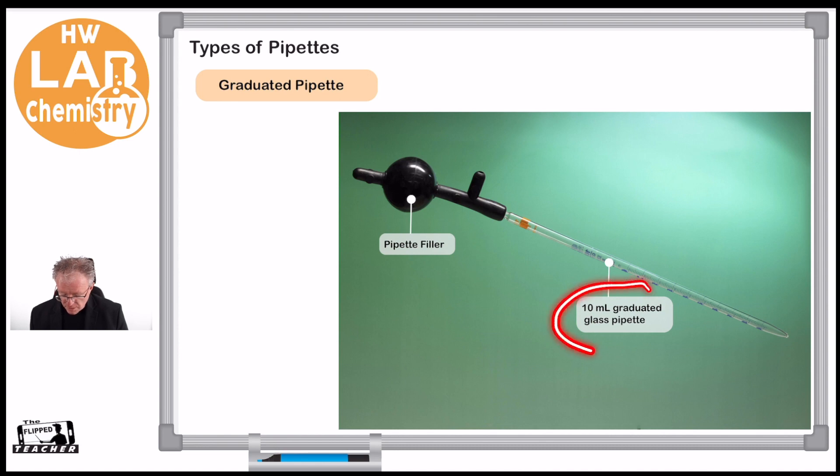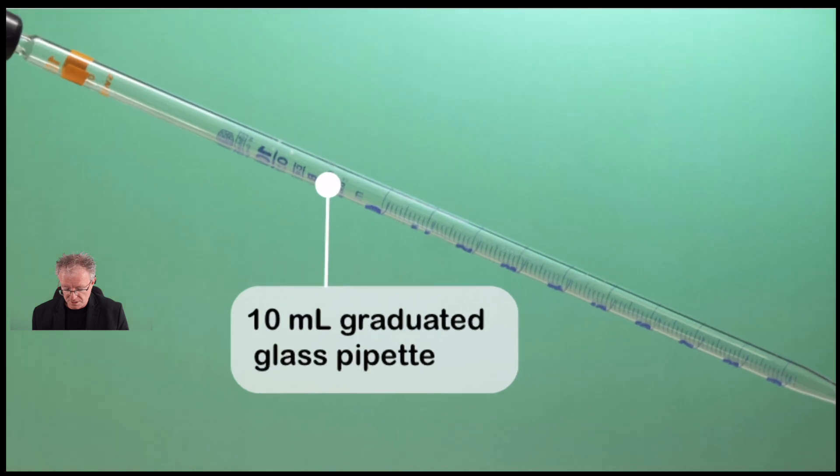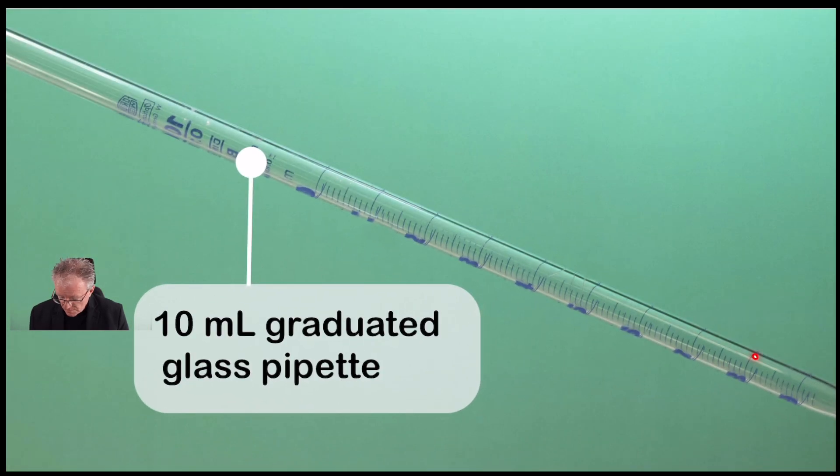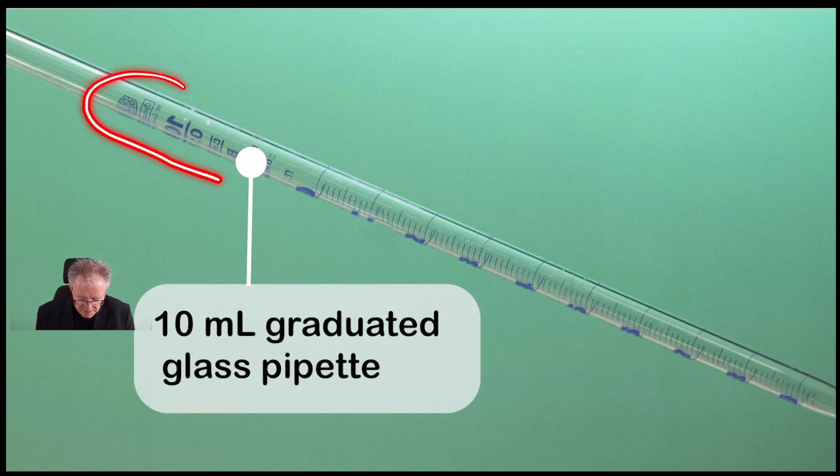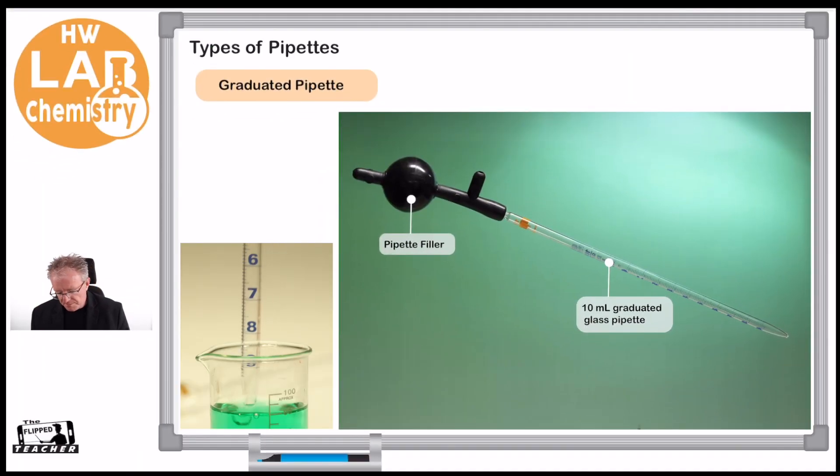So here we have the graduated pipette. The graduated pipette has graduations—let me just enlarge that. You can see we've got volume graduation marks. We've still got the details at the top which tell us about the volume. This one's a 10 milliliter pipette, but these aren't as accurate as our volumetric pipette.